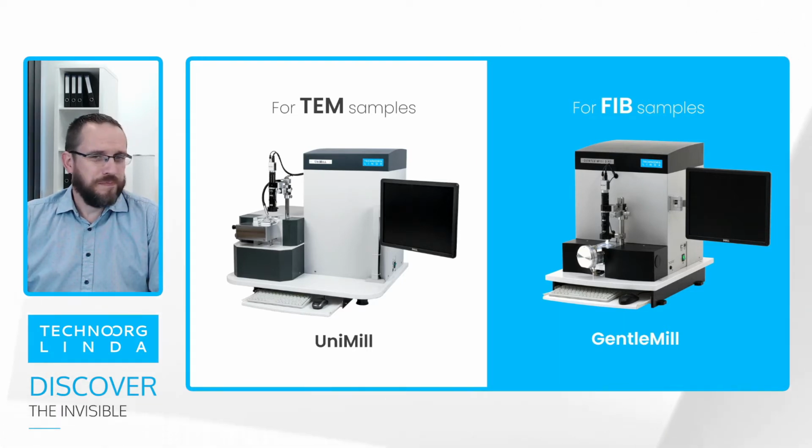Let me shortly interrupt just for a second, because it's very important to understand and make clear what's the main difference between this kind of devices or configurations, because as you mentioned, there are 2 ways of preparing these TEM samples. One is having a bulk material and finishing the whole procedure. This way has certain advantages, not just the cost but many others.